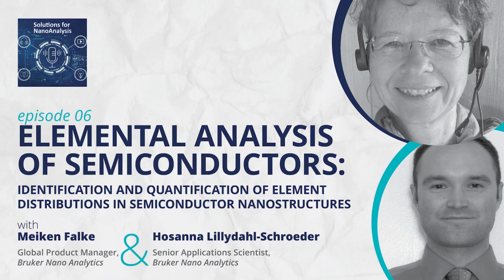Yeah, this deconvolution is maybe not as straightforward as with EDS, since, as I mentioned, the background is so complicated, and all processes which have happened at energies below the energy I'm looking at are convoluted with each other and need to be tackled when I want to subtract the real background. But maybe there's also another issue.